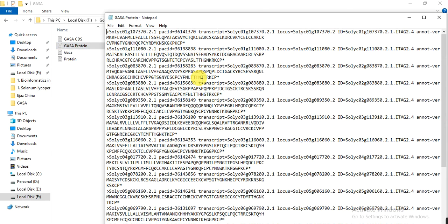In this way you can also take the genome sequence and the promoter sequence — I have already made a video on how to extract the promoter sequence of your genes and the genome sequence. This is all about how to do the BLAST analysis through TBtools and get your CDS, protein, or other sequences from your genome files. Hopefully it will help you. If you have any query, please don't forget to comment and contact me — I will try my best to solve your problem. Thank you.